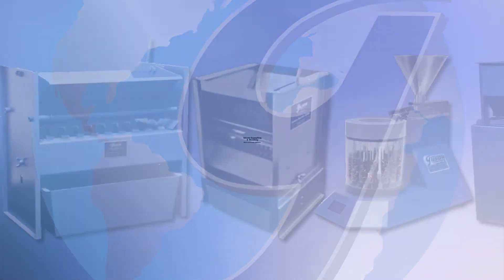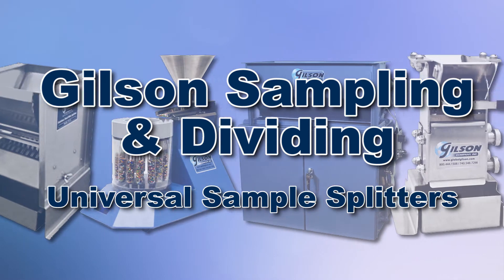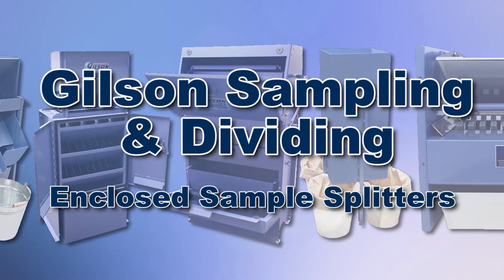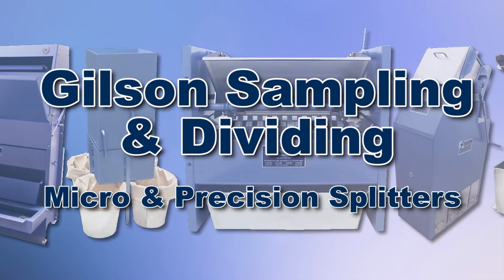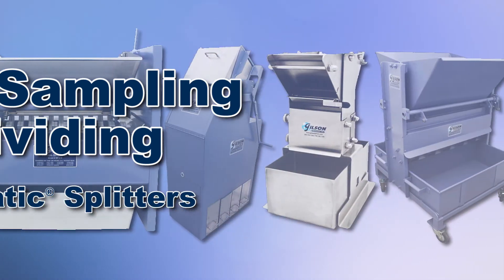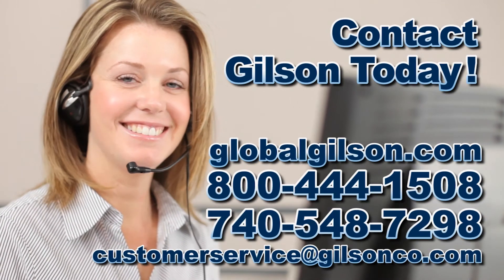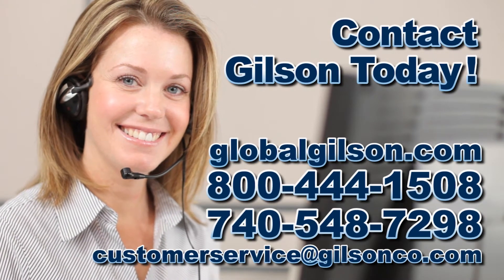With Gilson's complete family of sample dividers and splitters offering a wide range of performance, features, and capacities, Gilson has the right equipment for your fast, accurate, and reliable representative sampling needs. Be sure to check out these and all our products listed in the Gilson catalog and on the Gilson website.